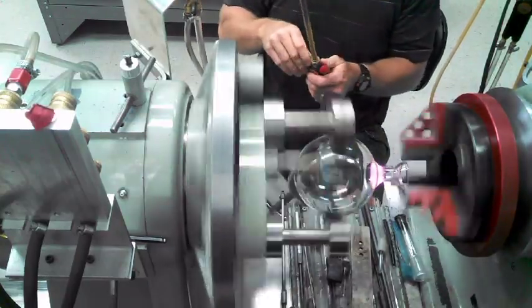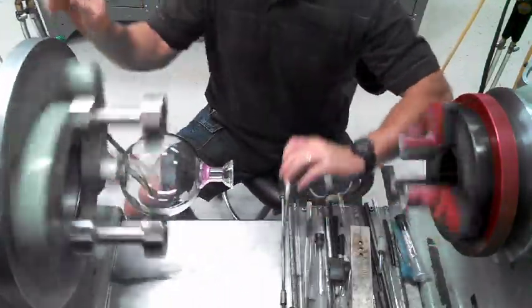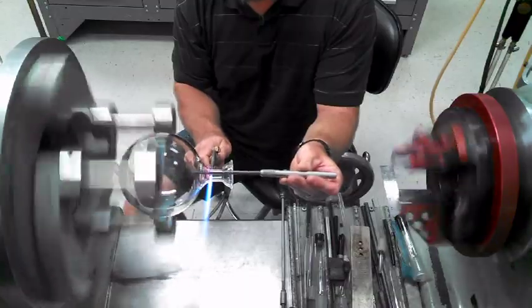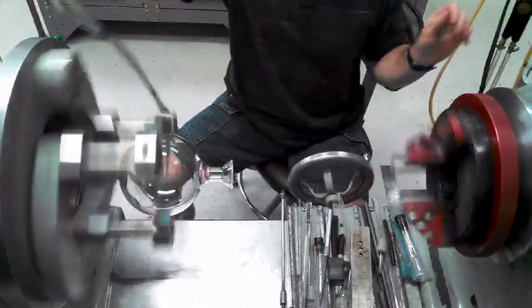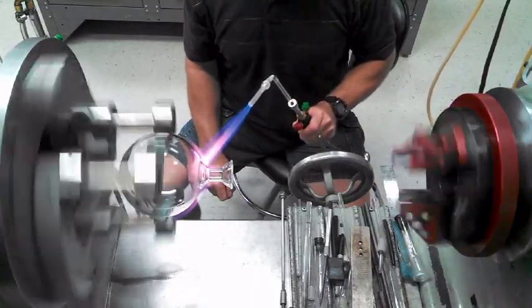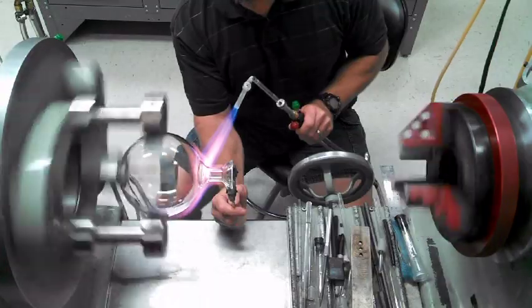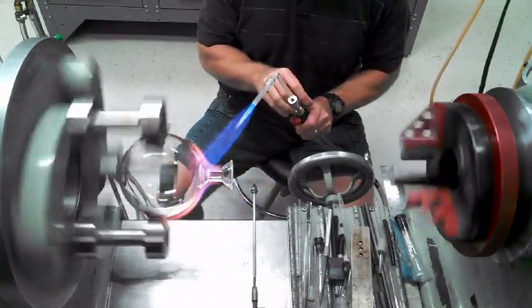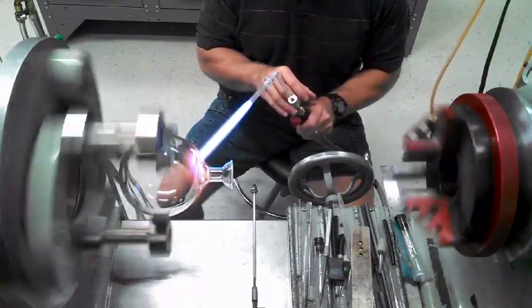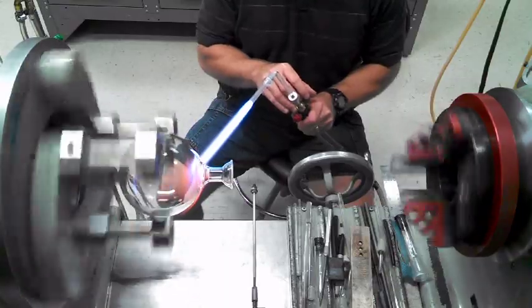Now, that looks good. I'm going to loosen that up. Now, this is still hot — come in here and just bring the ID up slightly, like that. A little cannon needle. I'm going to straighten this a little bit here. There we go. Put some butter to it. Good to go.